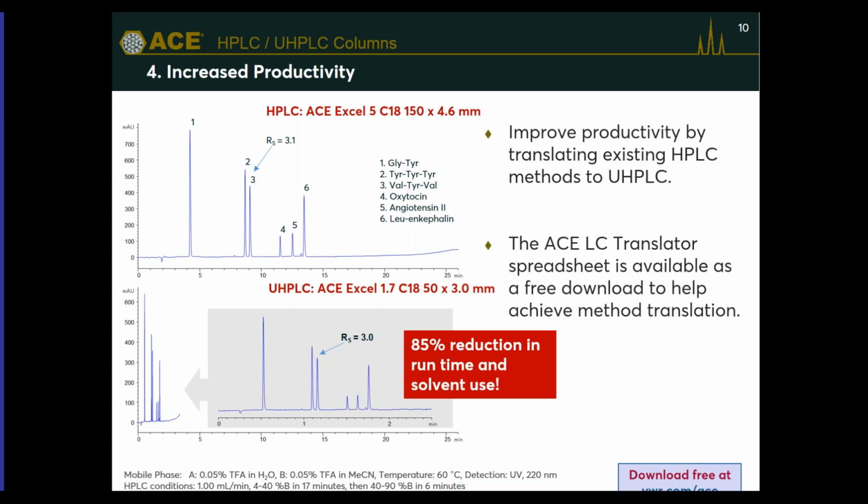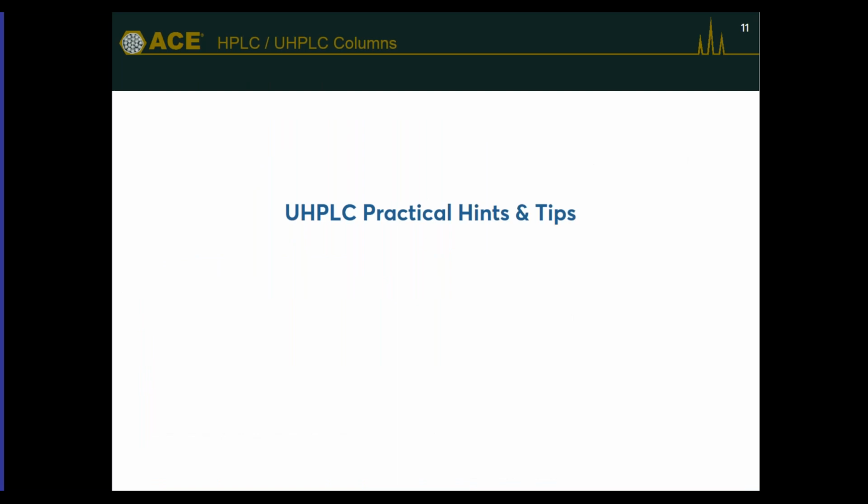And in fact, if you look at the statistics and the data, you can see there's an 85% reduction in the runtime and also the solvent use. So UHPLC can provide us with these opportunities. So that's a very brief overview of some UHPLC benefits.